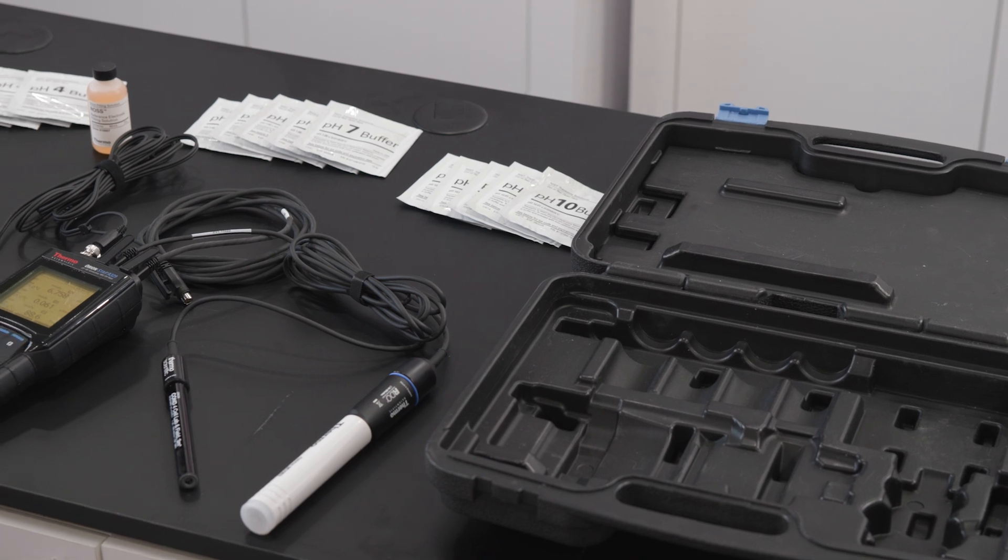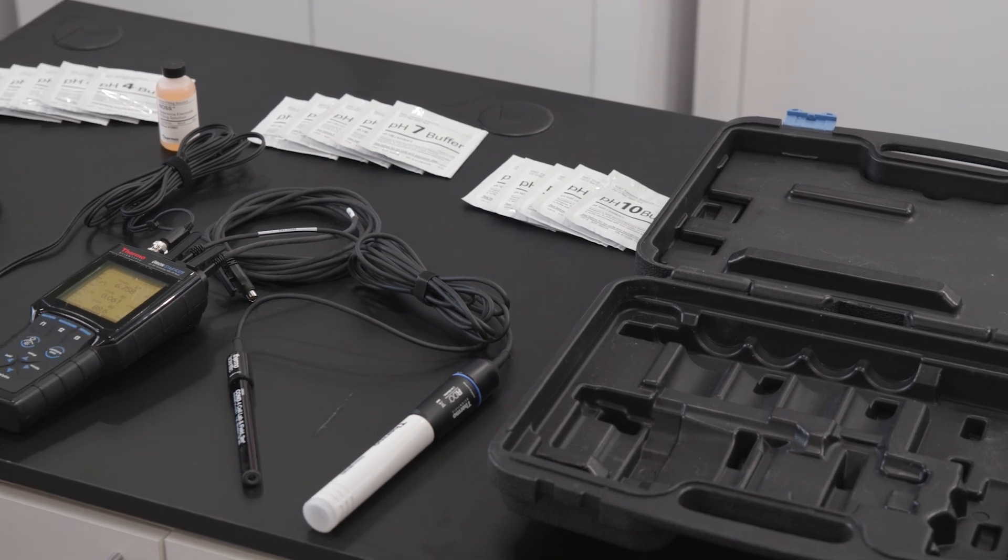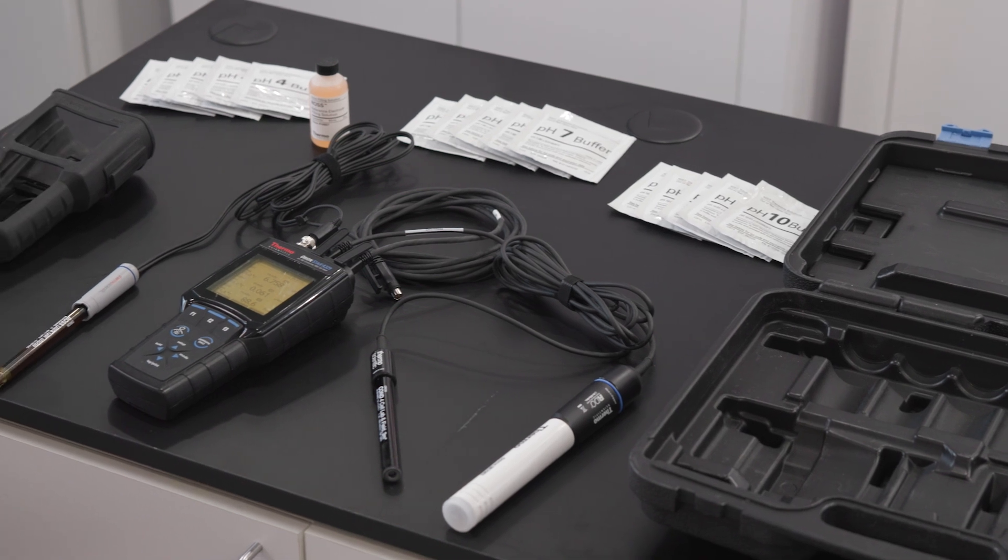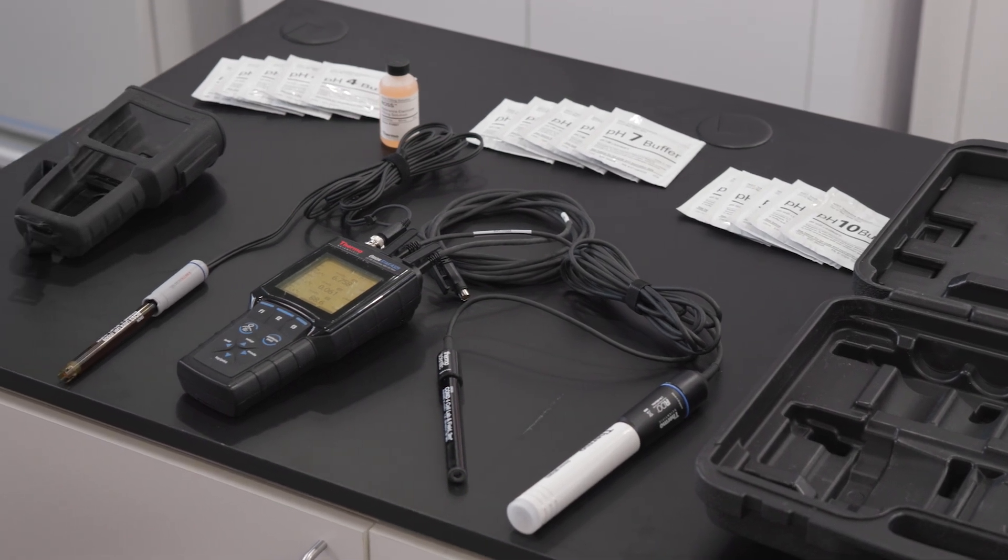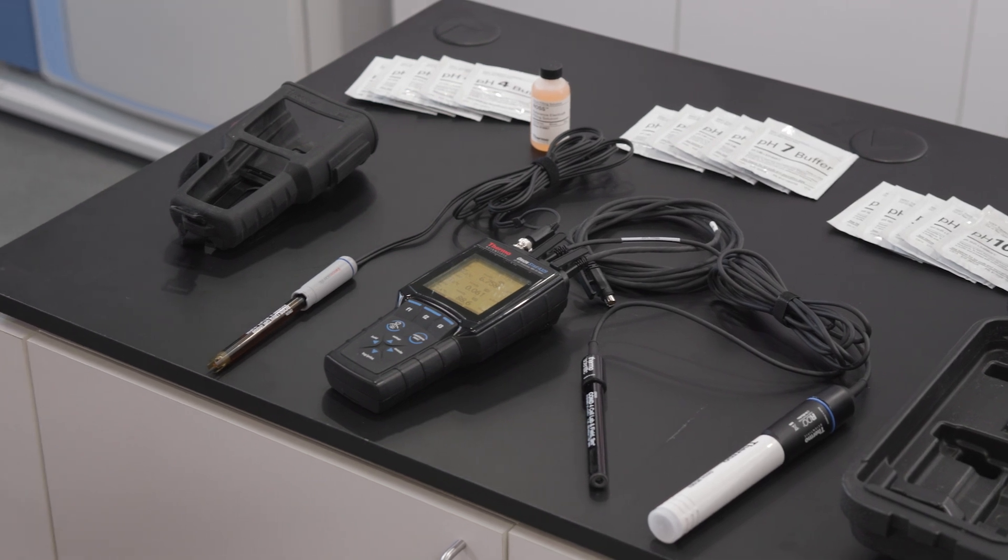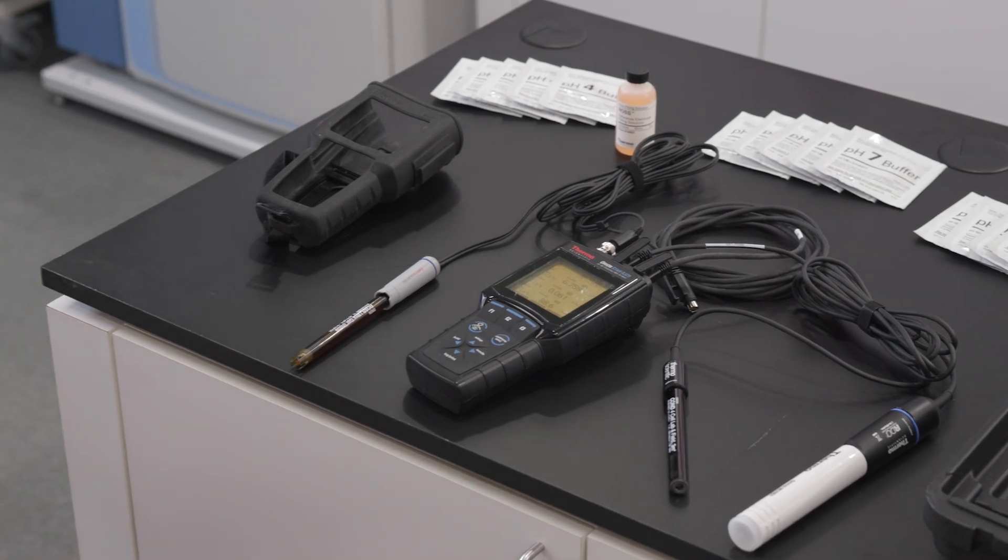Once you've identified the right meter for your needs, you may also want to consider purchasing a meter kit. Meter kits support different types of sample testing and include an electrode, applicable electrode fill solution, electrode storage solution, and pH buffer solutions all conveniently packaged in a hard-sided carrying case.